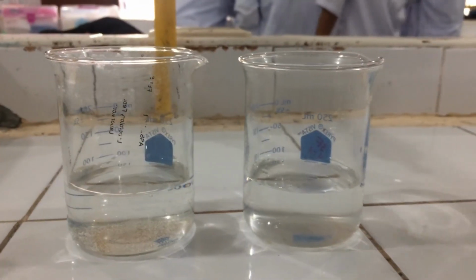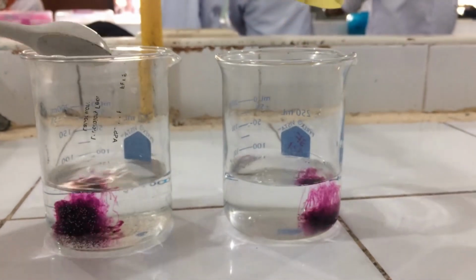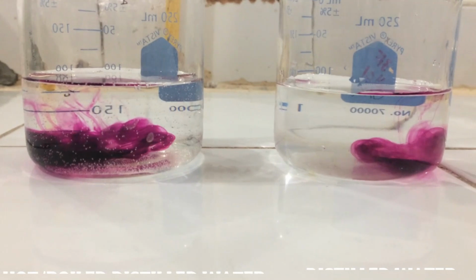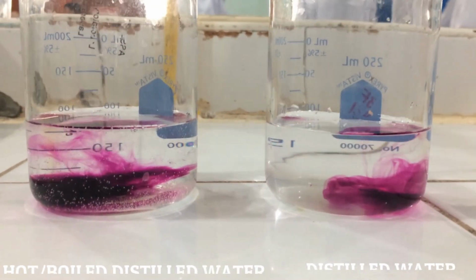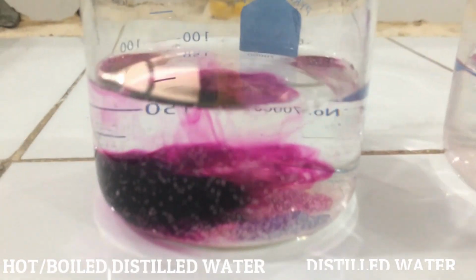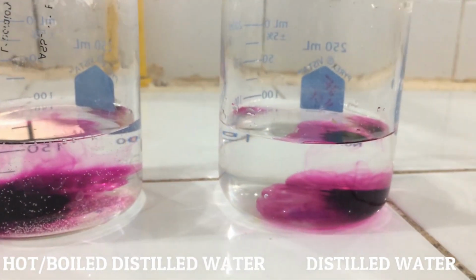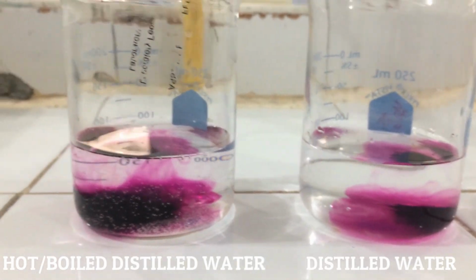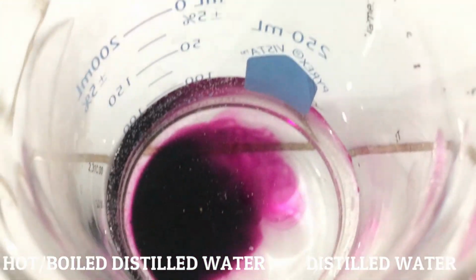Now, place the two beakers side by side and drop at the same time 2 to 3 crystals of potassium permanganate into each beaker. Let us observe and compare the rate of diffusion of the solute.